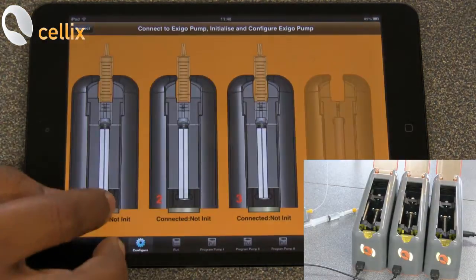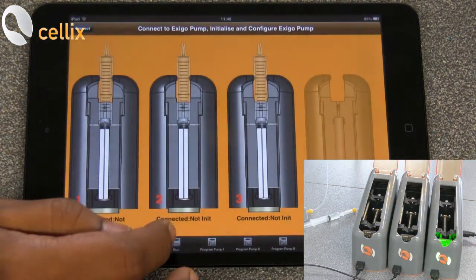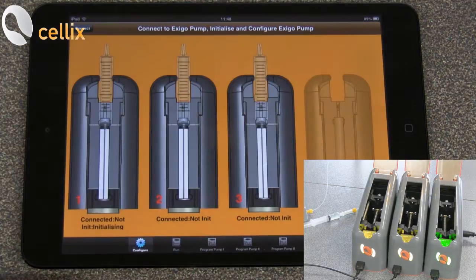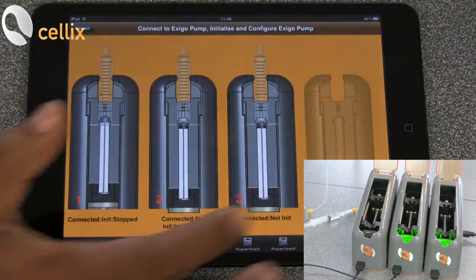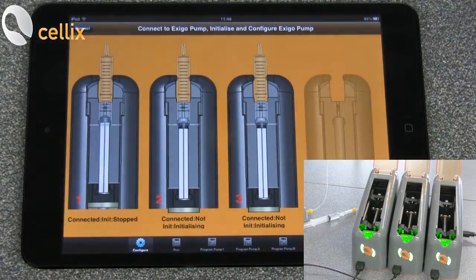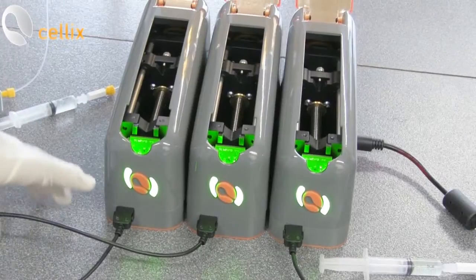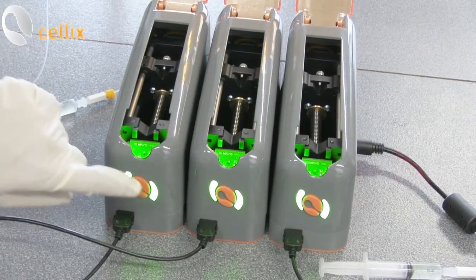Then you have to initialize three pumps. Double click the first one, initialize the second one. Once the pump is initialized, the light changes into green.